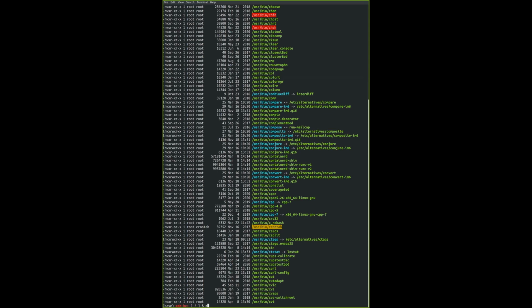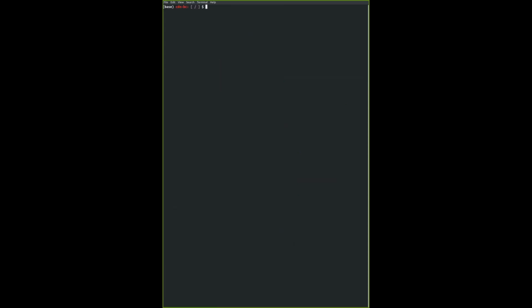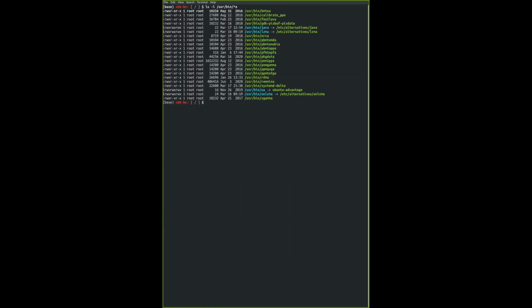I'm going to clear the screen first before I print out the next function, ls, and then the second command, which ends with the letter A. We also already showed this earlier on. So it's an asterisk followed by an A. So this is not too bad.